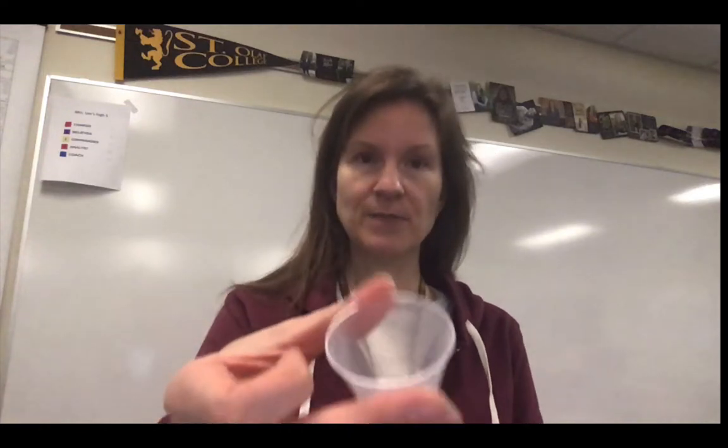This video will help you through the limiting reactant lab. So step one for the lab would be to go through and do the pre-lab questions. The pre-lab questions are writing the complete and balanced chemical equation, given the fact that magnesium is going to be solids, so they're little pieces of magnesium solid, and then the HCl will be dissolved in an aqueous solution. So what's going to happen includes states of matter.